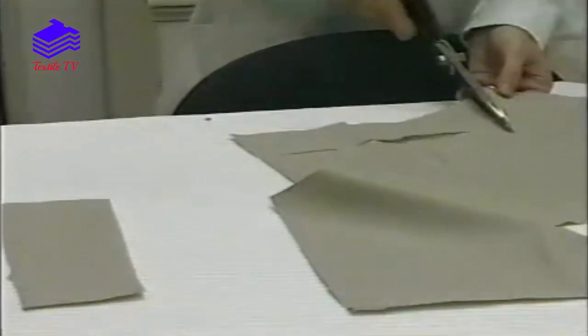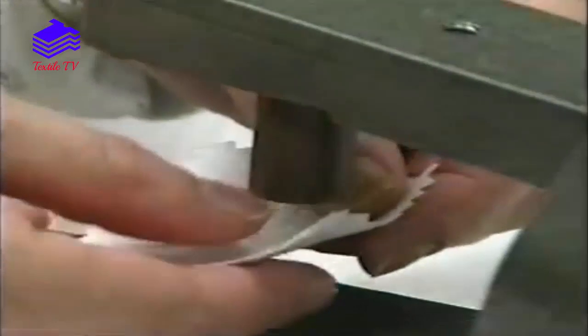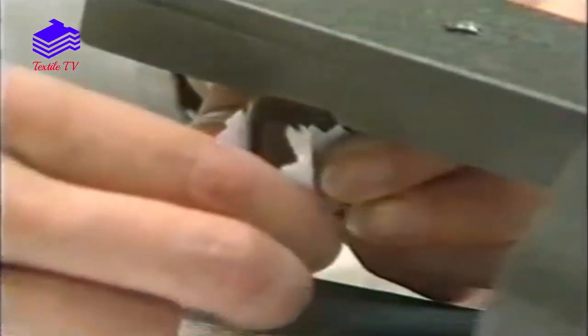Strips of fabric are cut from the test sample. A square of cotton lawn fabric is mounted onto the peg.